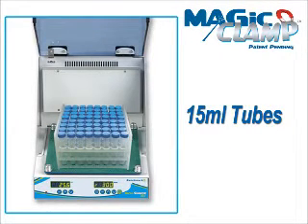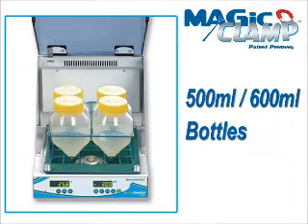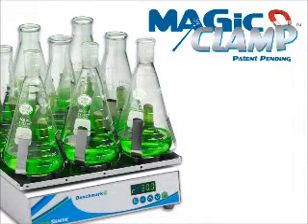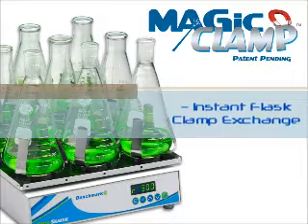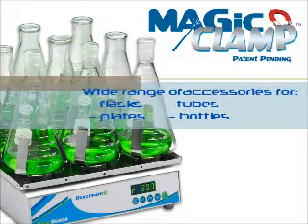In addition to convenience, the Magic Clamp System also adds versatility. While many traditional platforms are only designed to hold flasks, the Magic Clamp Platform holds a variety of racks for tubes, bottles, and plates. The Magic Clamp System from Benchmark greatly reduces the amount of preparation time associated with orbital shaking and offers flexibility over a wide range of applications.